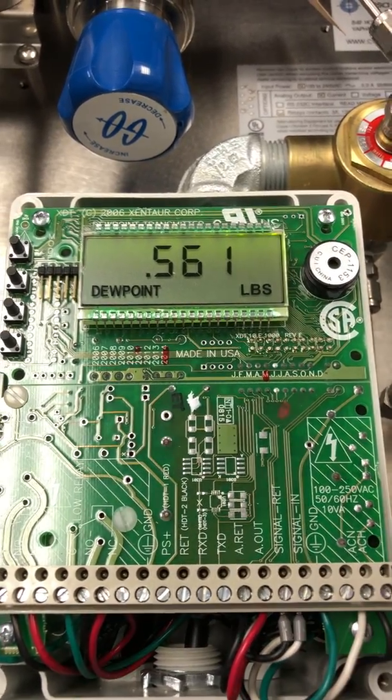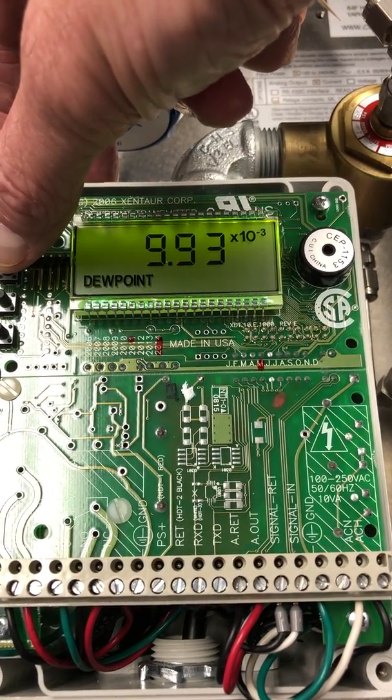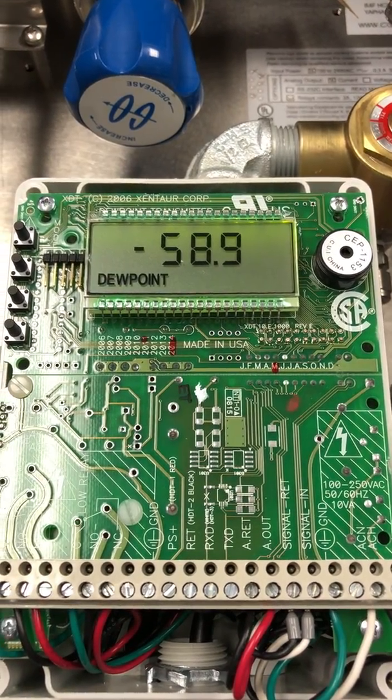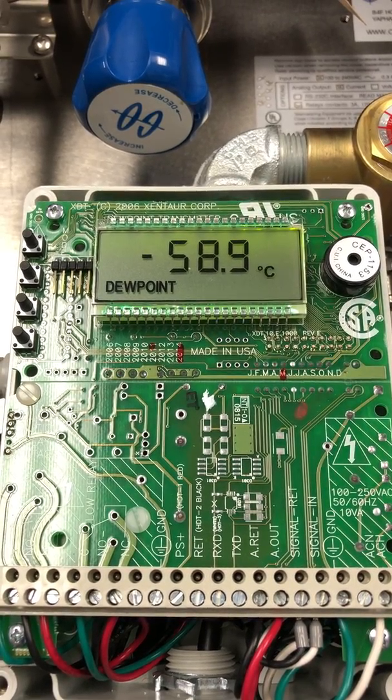Now we come back and we're reading pounds and it's locked. If we try to change it back to degrees C, you'll see the LOC — the lock command. If you change it to degrees C for a moment, it will switch back to pounds. It will revert back to its last locked units.